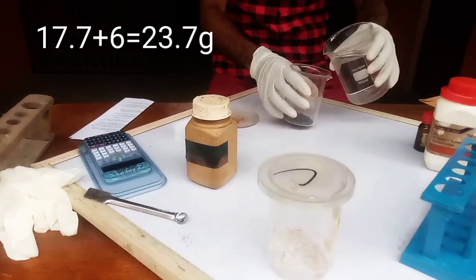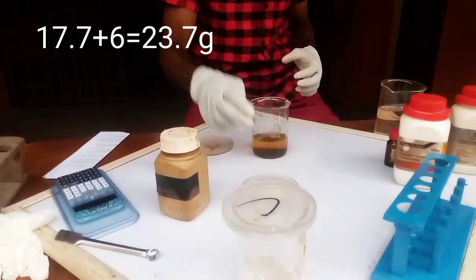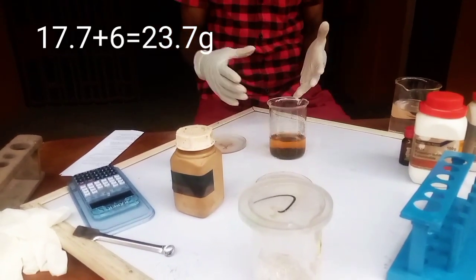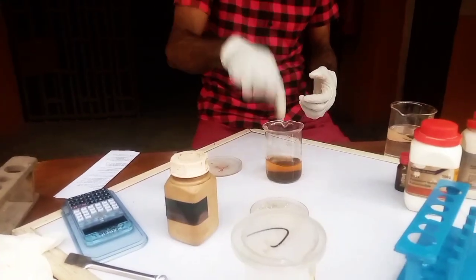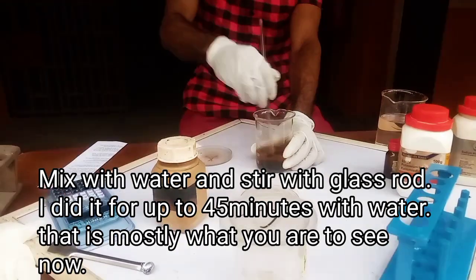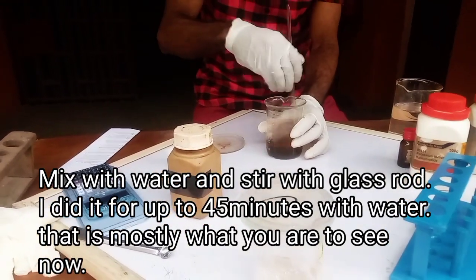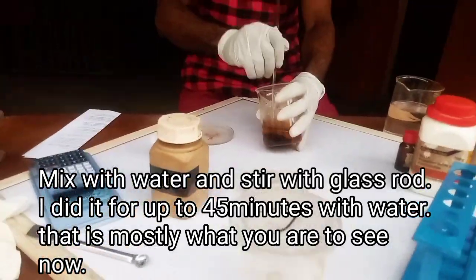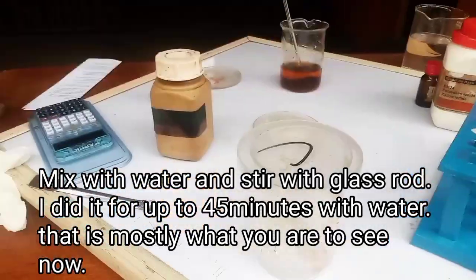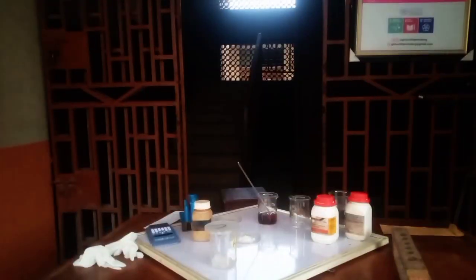Okay, the next thing to go for is to try to dissolve this iodine in water. Yes, it is not going to be easy. I removed the beam balance because it's no longer important, because I've actually measured the three things that are required. Then this water was actually 400 ml, and I'm trying to shake this in order to see that this dissolve.